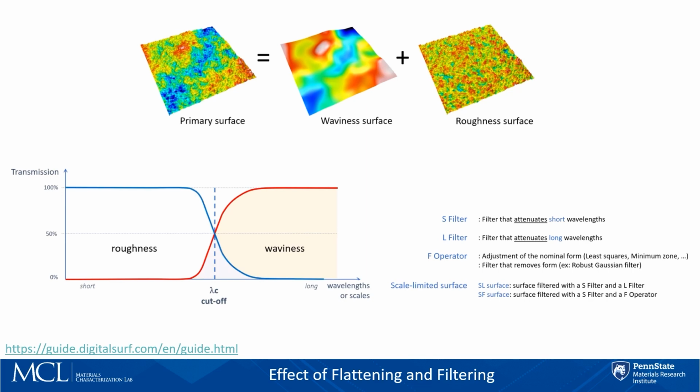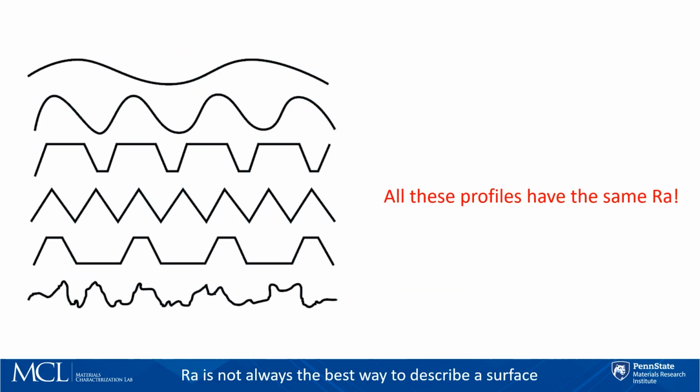So this brings me to the last part of the talk, and that is that I've said that how we collect our data and what technique we use, what conditions we use, how we post-process our data, these are all going to affect what the reported surface roughness of your sample is. Now again, it's all correct as long as you are not introducing features like the bad post-processing example that I gave. It's just correct for those conditions.